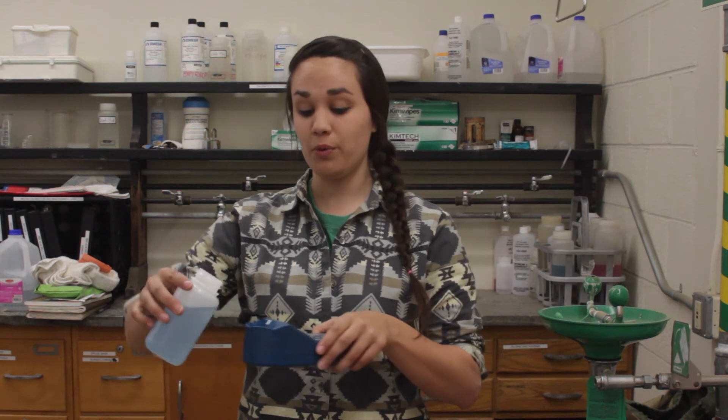My meter is requesting the basic solution, so I can empty that solution from my meter, use my last solution, and do the triple rinse once more — one, two, three.